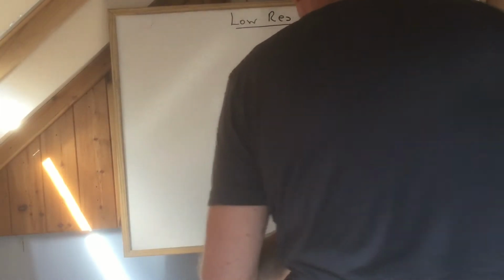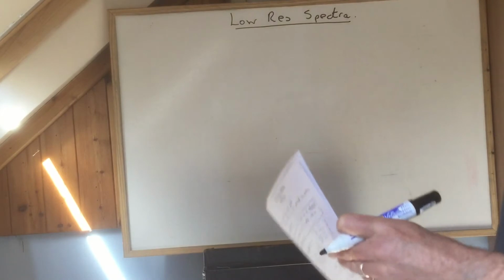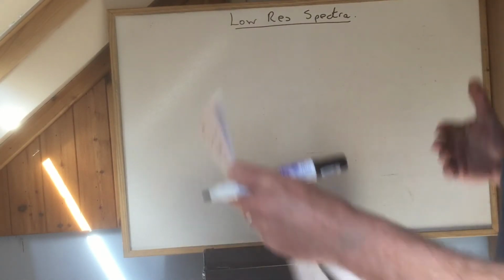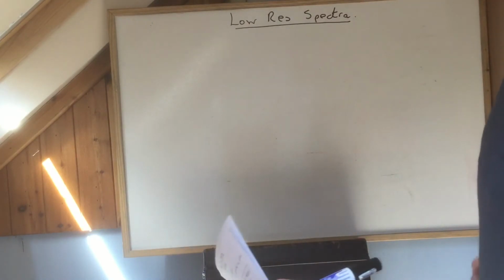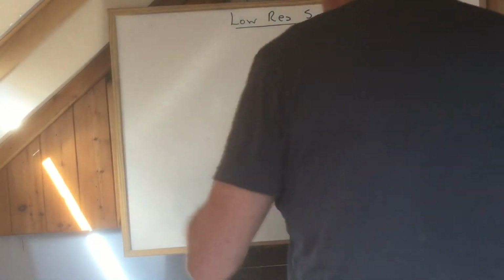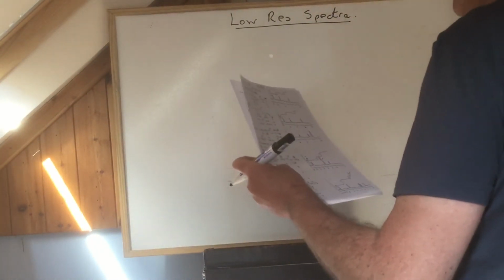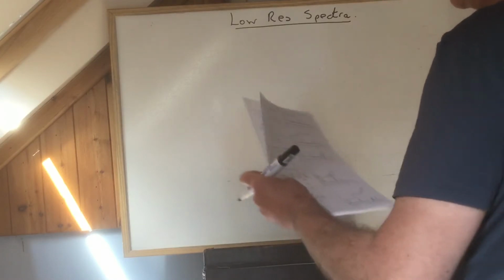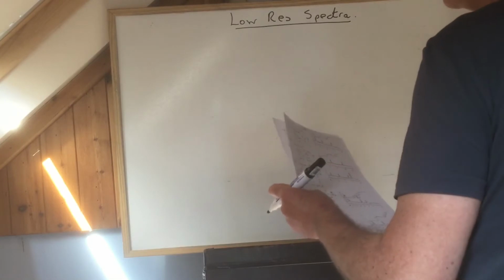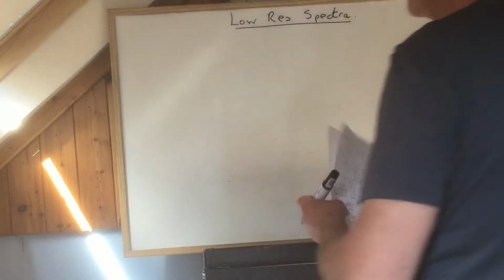A few examples. Okay, I'm going to use a lot of esters for this, because esters are quite popular. We'll look at other things, we'll deal maybe with some difficult ones, different ones later. But I'll stick with esters for now. So all I'm going to do with you is just talk through what these spectra will look like for various low resolution, i.e., no splitting, a number of different possibilities that hopefully you'll grasp where I'm coming from.